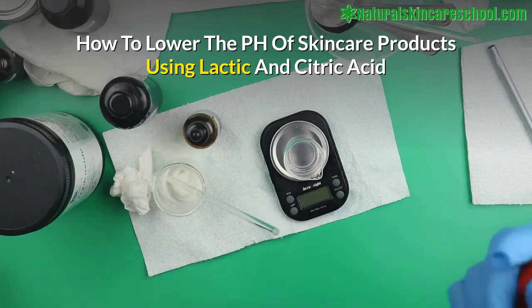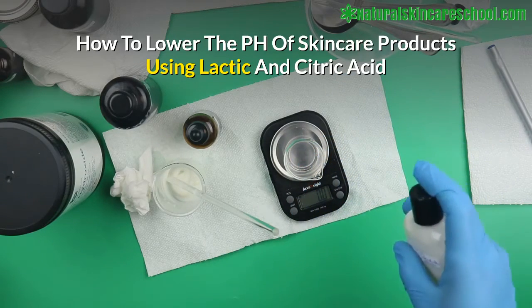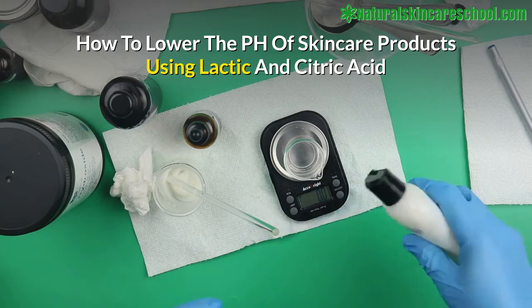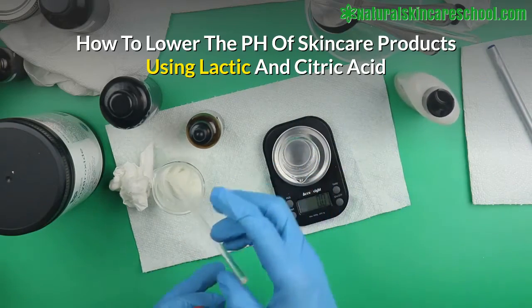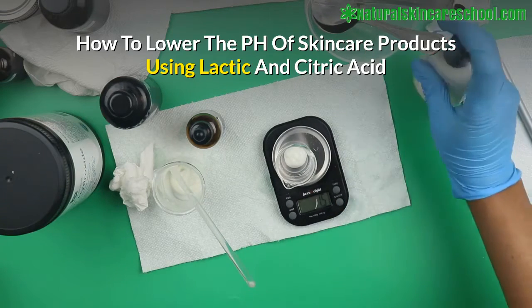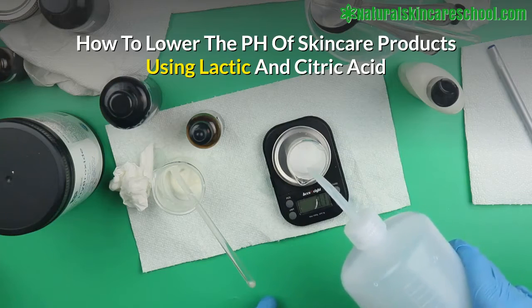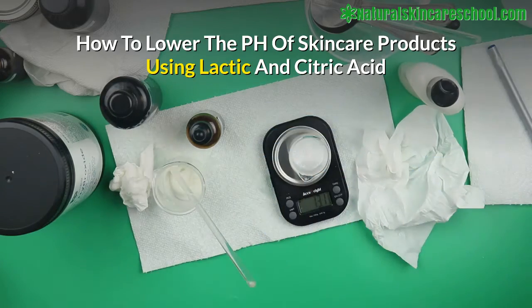The first thing you want to do when you finish formulating your skincare product is check the pH, to make sure it's okay. The pH of this skincare product is 5.3, but for the purpose of this video I want to show you how I check and adjust it. To check the pH of your lotion, you get a scale, put one gram of your lotion in, then add nine grams of distilled water to make 10 grams total.